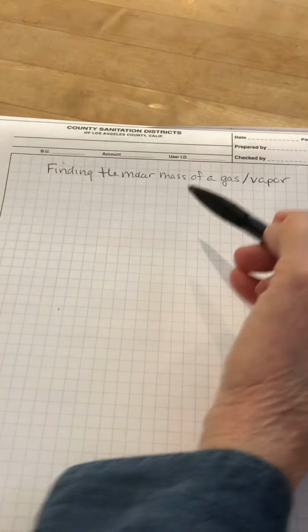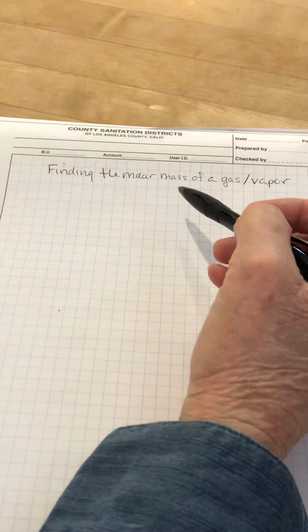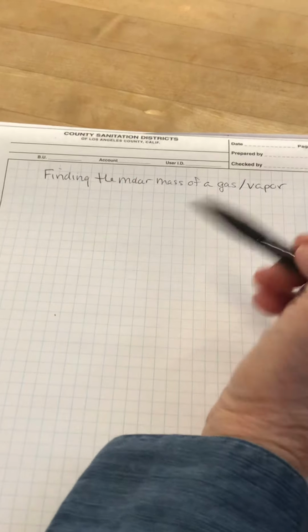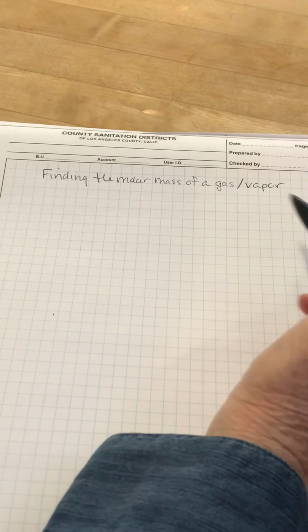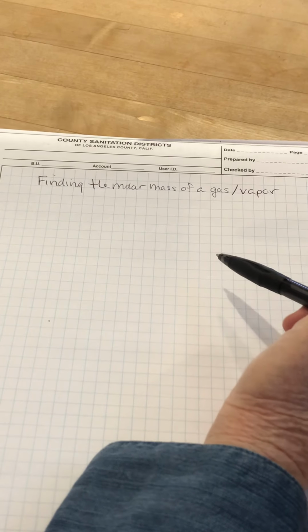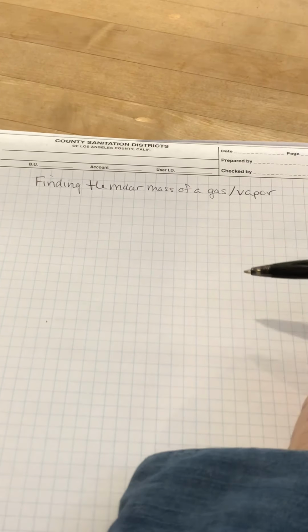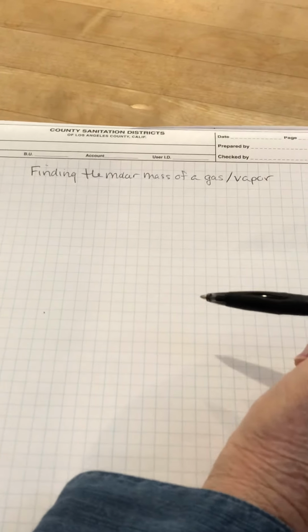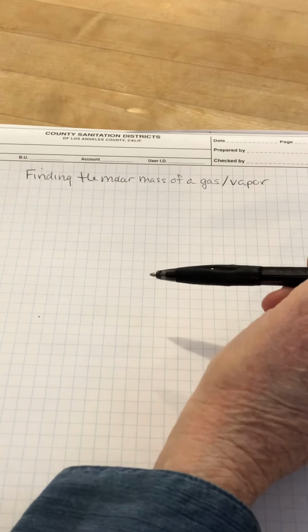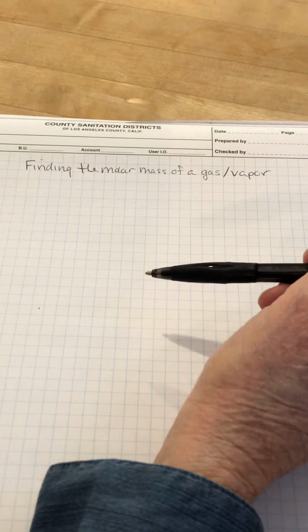And to do this sort of experiment, which we can't do, you would put about 5 milliliters of a liquid that I knew the identity of in an Erlenmeyer flask. We'd put a foil cap on the Erlenmeyer flask, and then you would place the Erlenmeyer flask in a beaker of boiling water. That would turn the liquid into vapor at 100 degrees Celsius.